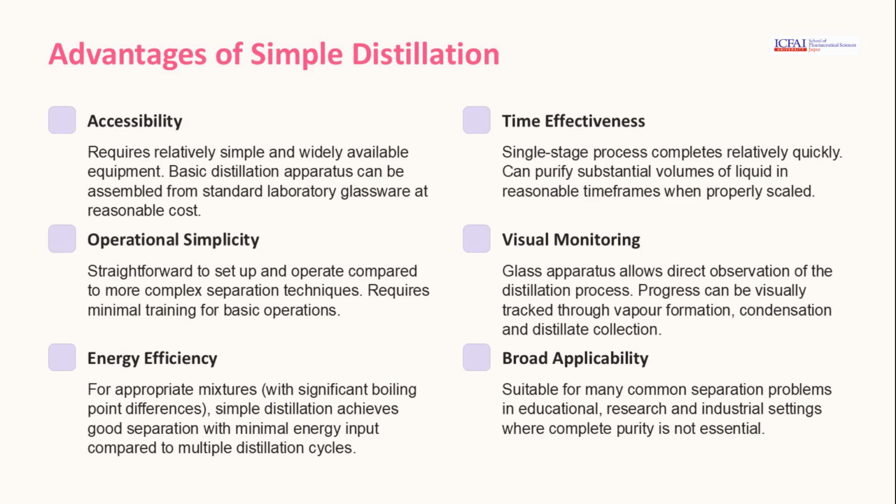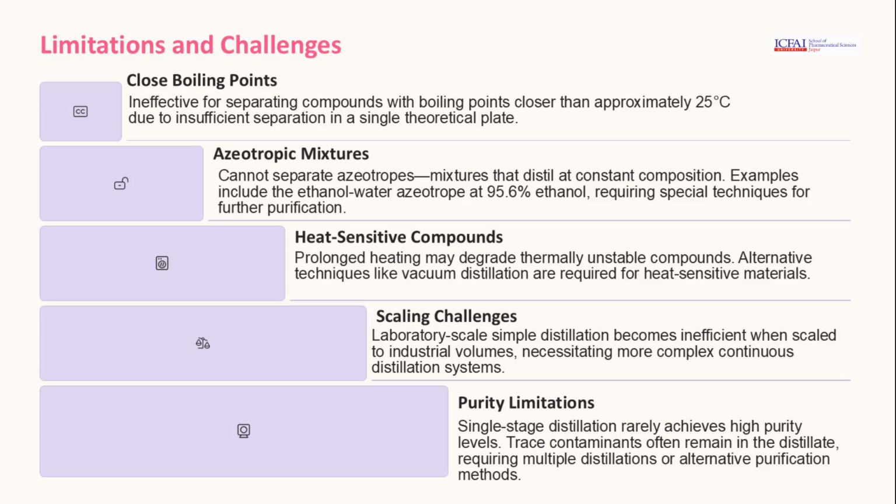Simple distillation offers advantages such as accessibility, operational simplicity, energy efficiency, time effectiveness, visual monitoring, and broad applicability. These benefits make it a preferred method for many common separation problems. Despite its advantages, simple distillation faces challenges like close boiling points, azeotropic mixtures, heat-sensitive compounds, scaling difficulties, and purity limitations. Addressing these challenges is crucial for optimizing the distillation process.